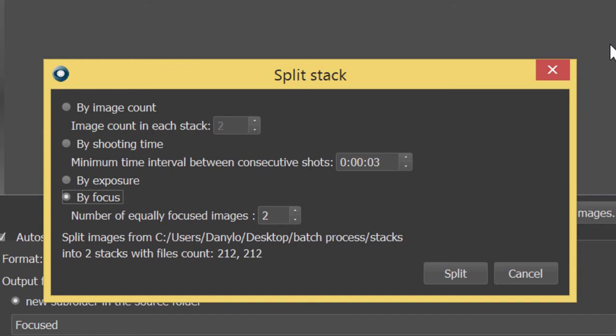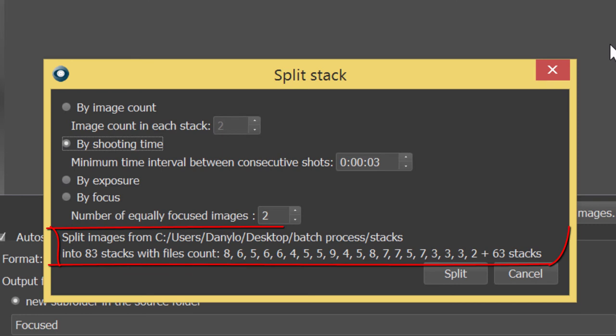In the bottom line of the split stacks window, you will see the resulting number of stacks. It will be updated each time you change the splitting parameters.